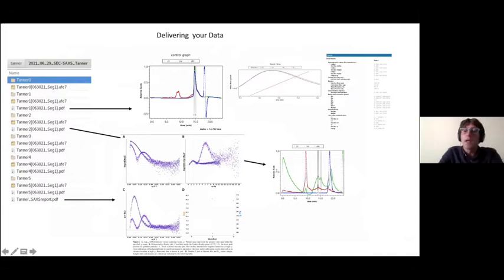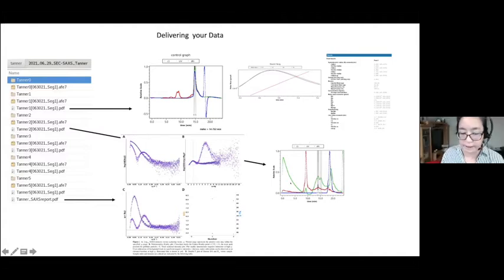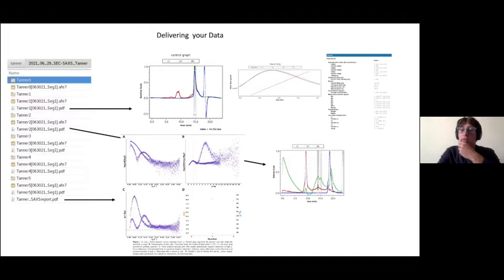Oh, this one? Okay, so this is a relative scale. So you need to look at the actual UV signal. The intensity of the UV signal is 0.0 something, so this is basically zero baseline. Everything you see here is zero baseline. Yeah. Okay, sorry. Yeah, it's just very, very zoomed in because this is a relative scale. Yeah, that's a good point.